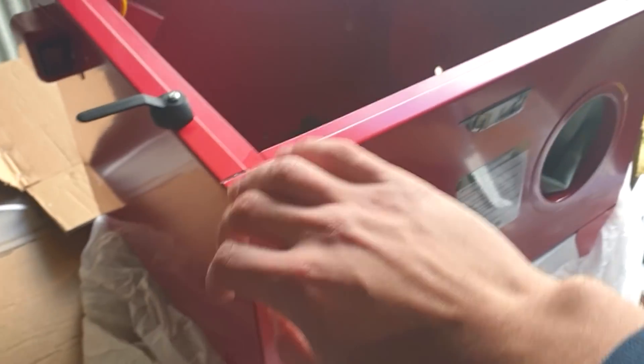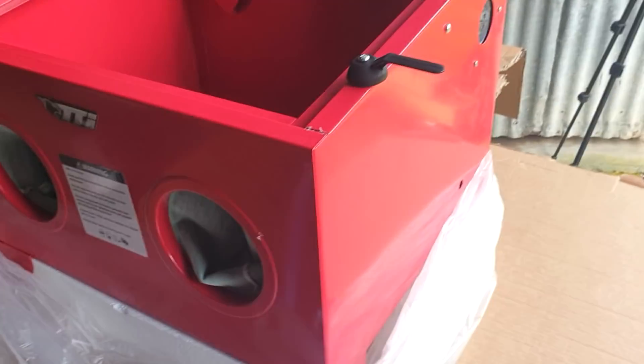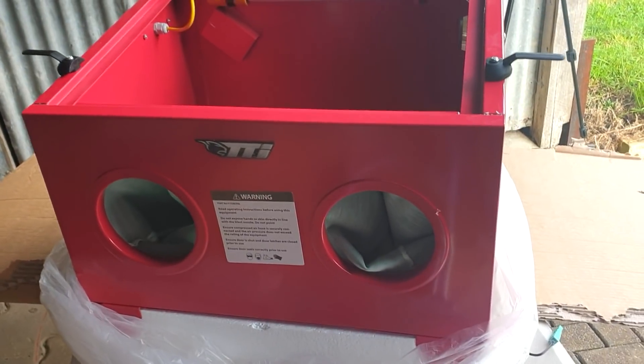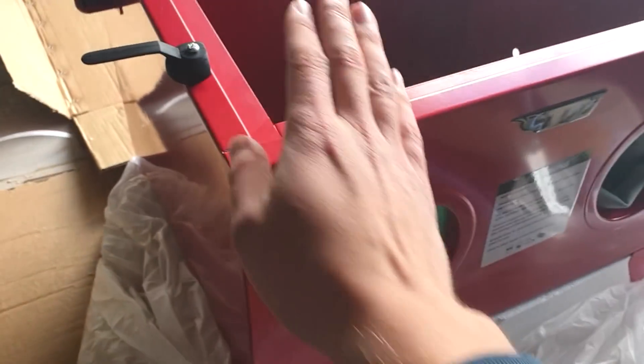It wasn't cheap — 200 Australian, so about 150 US. I wouldn't call this a cheap DIY solution, but it's affordable. The advantage is that it's metal. This is acrylic, but the rest is all metal. So for holes and gaps we can weld it, and if we want to put holes through, we can drill them easily — good holes that can seal well — which I think makes it better than plastic.